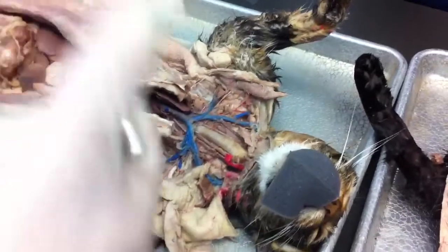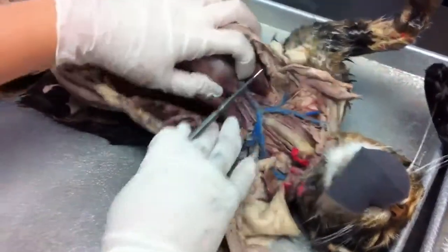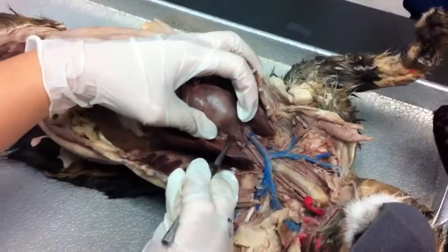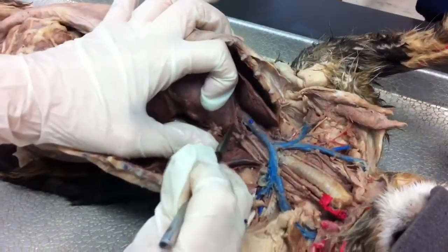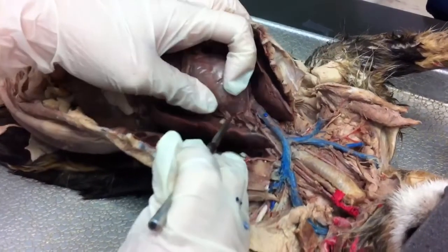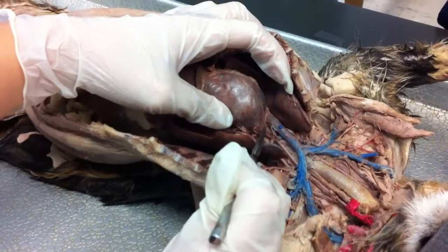Now the arteries, I have to do all these contortions with my hand to open it up so you guys can see it sometimes. So I'll try to do my best. But this vessel that comes right out of the top of the heart, it's this little bump right here. Kind of looks like a little pyramid shape. This right here is the aortic arch. It actually sort of wraps a little bit around this way. Aortic arch. So if I were to pin it, I'd pin it right at the top of the heart.